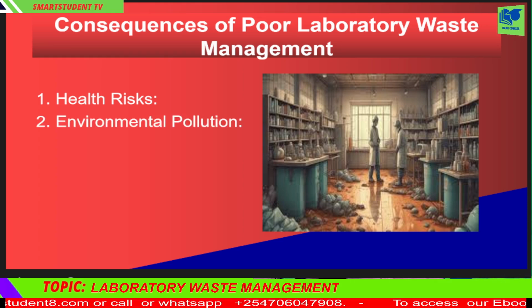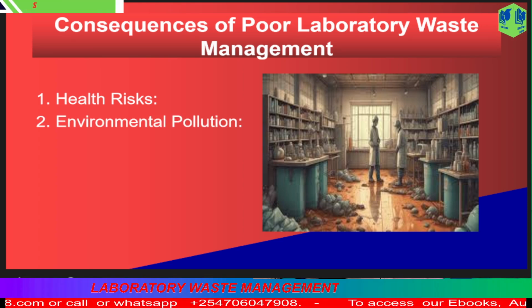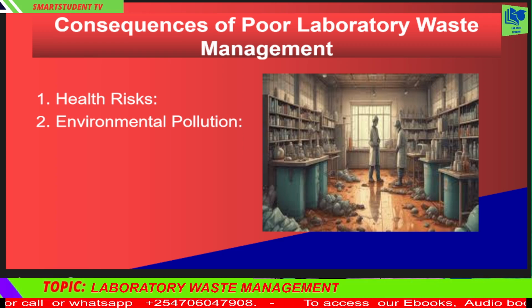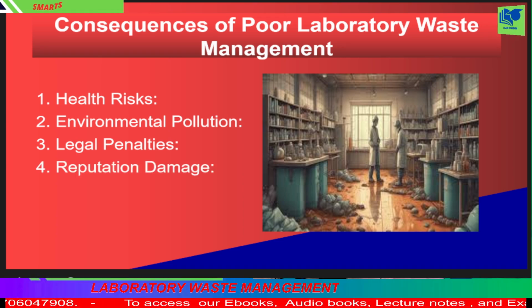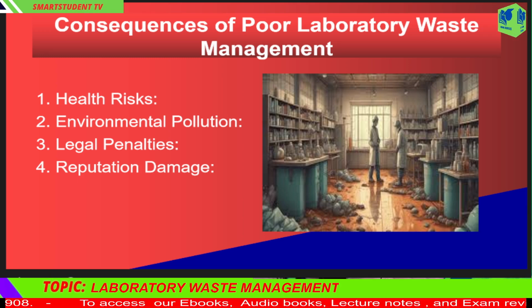2. Environmental pollution, contaminants leaching into ecosystems. 3. Legal penalties, fines and legal action from regulatory authorities. 4. Reputation damage, loss of trust and credibility for institutions. Hierarchy of laboratory waste management.